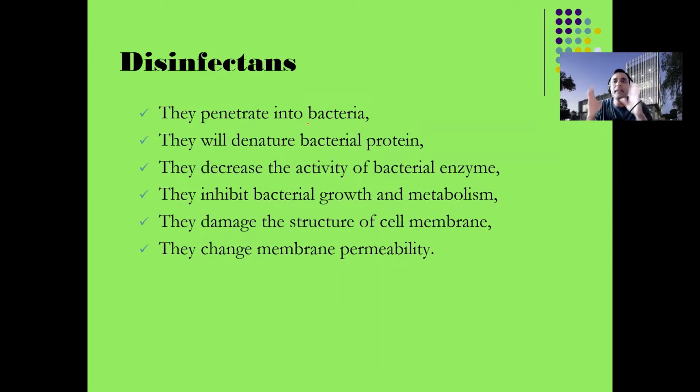So a disinfectant must have some compound that helps in penetration through the cell membrane and cell wall of the bacteria and fungi. Detergent, for example, is the first and most important disinfectant for any kind of explant. So detergent has to be used. Now, I used detergent from Walmart, from the supermercado. They truly work very well, but their efficiency sometimes is not very good.